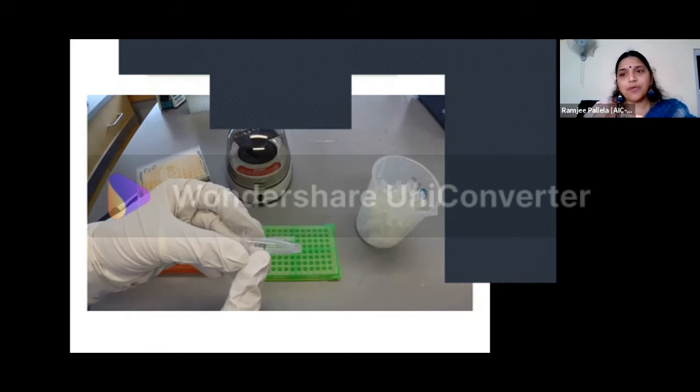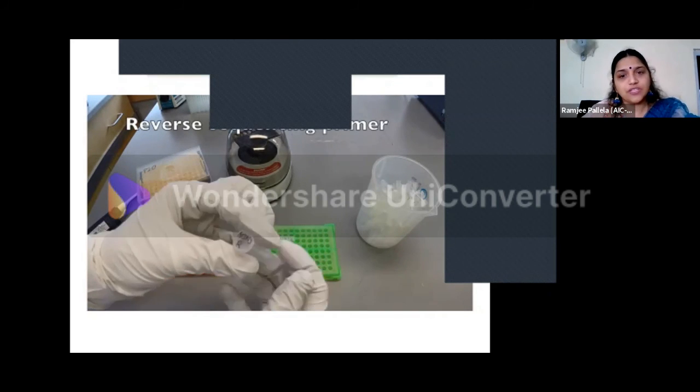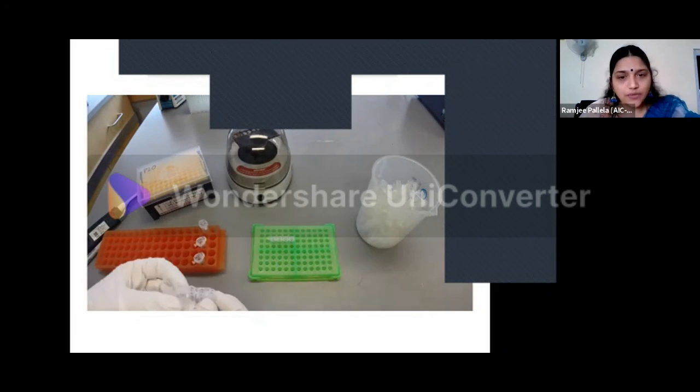We are preparing our samples for our sequencing. So we are taking all the reverse sequencing primers and forward primers, and keeping everything together with us because we have to go next for the sequencing.